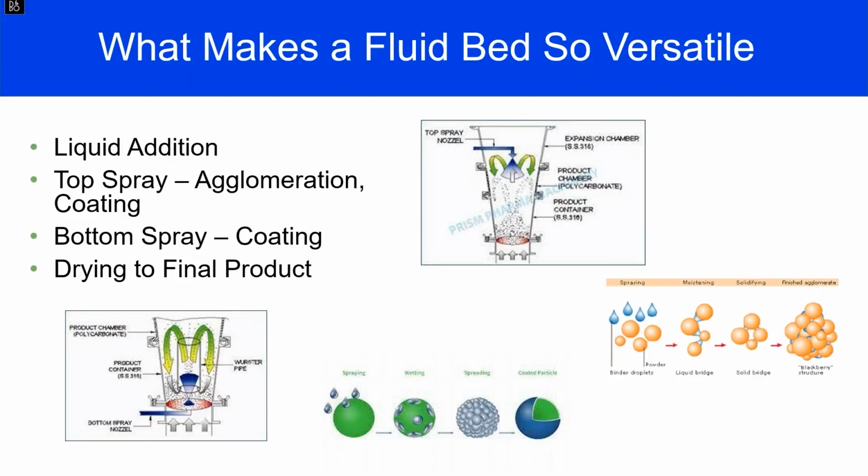Most of the characteristics that we're looking for. I'll give you some examples where that's not what we're looking for, but from a flowability, from a wettability standpoint, we're looking for this sort of structure.